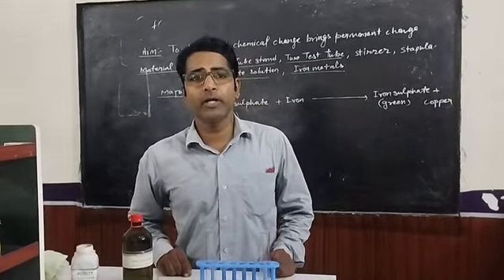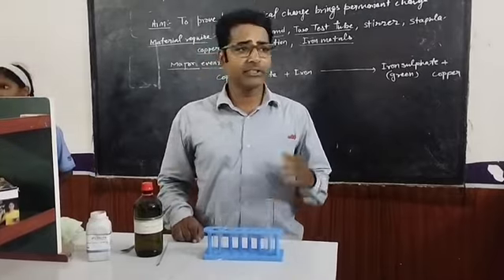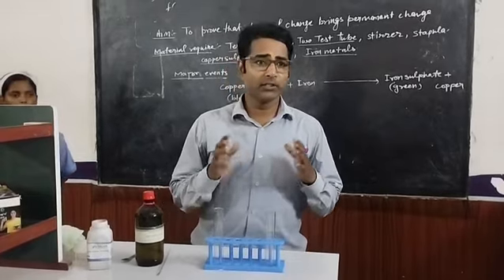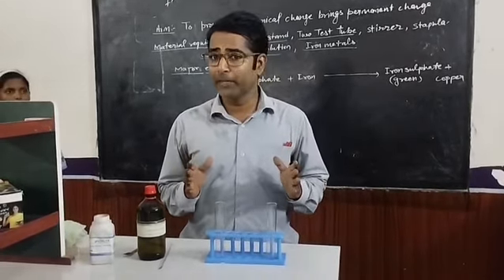So dear student, today we are going to perform a chemical reaction, and through this chemical reaction we would observe that a chemical change brings a permanent change. So for this experiment we require some instruments.